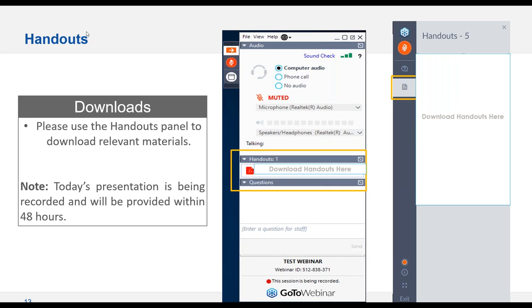In my experience, it depends on the matrix. If you have a simple matrix, there's not much plasma loading, and you're not totally disturbing the plasma, then it's not as big of a deal. Even if it's an ionic line correcting for an atomic line, I find it'll do fine for physical interferences. So it depends on the sample types, but that's what we try to achieve, matching if possible, but most of the time, we don't really need to.